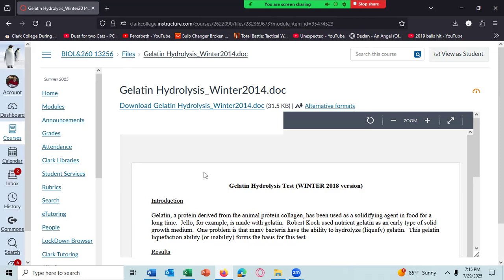I'm going to pretend like I'm going to send you the number for your unknown bacteria species tonight, and you'll be starting the gelatin hydrolysis test tonight, because you won't get the results for a week. And then next Tuesday, I'll send you the results.